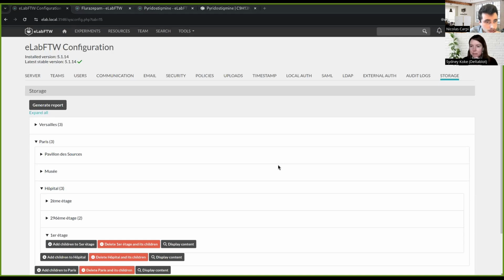Consumption scanner, Raspberry Pi. So Clemens is talking about a barcode scanner attached to a small client, a Raspberry Pi, and so you take a bottle out and you scan it, and the bottle gets subtracted from the stock. You should look at the previous meeting, if someone can put the link in the chat, where they have a little QR code scanner attached to a Raspberry Pi, and it works very well for their samples. This idea of taking something out, scanning it, and it gets subtracted is good.